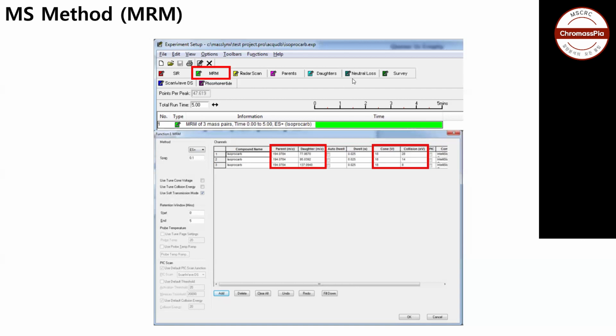Okay, so you mean to say that if we select the low intensity ion out of these three daughters, we will be able to pinpoint that this particular daughter ion is coming from that parent ion. Yes, that will be confirmation of your compound.